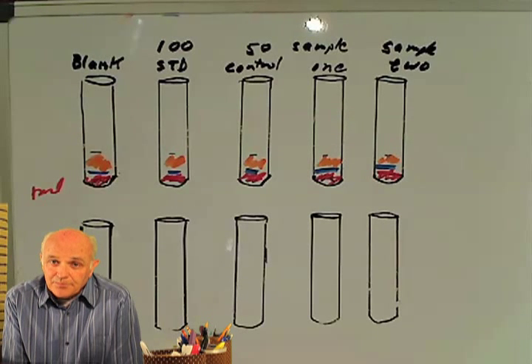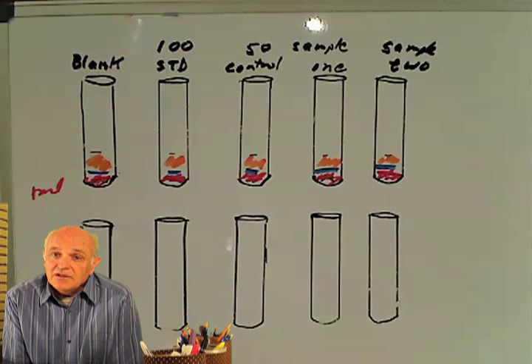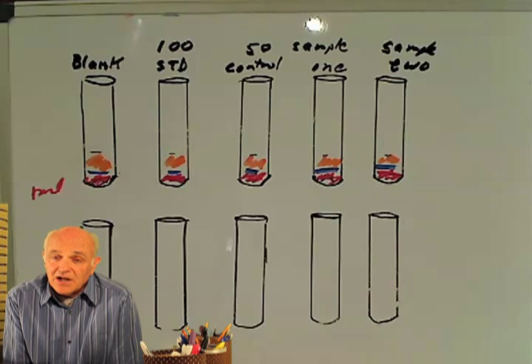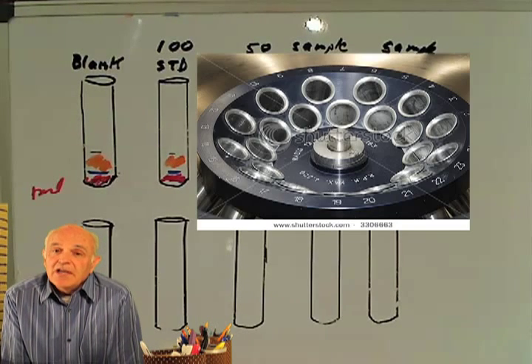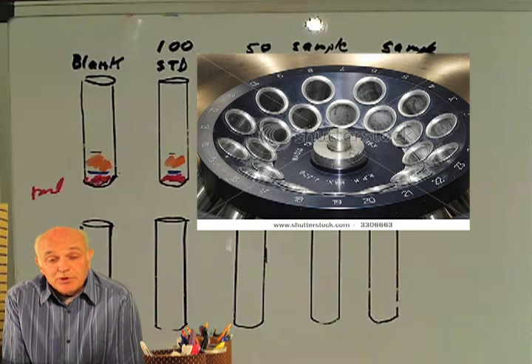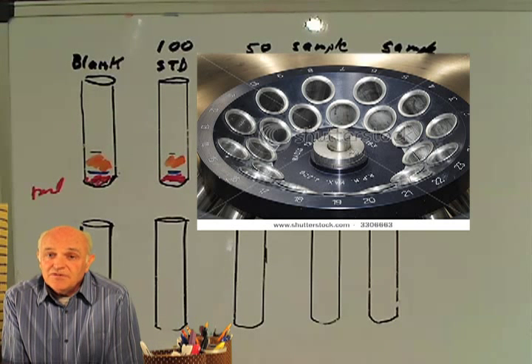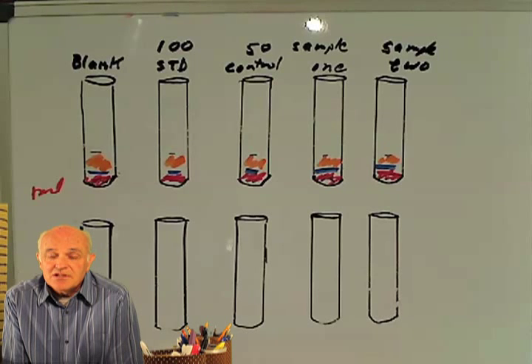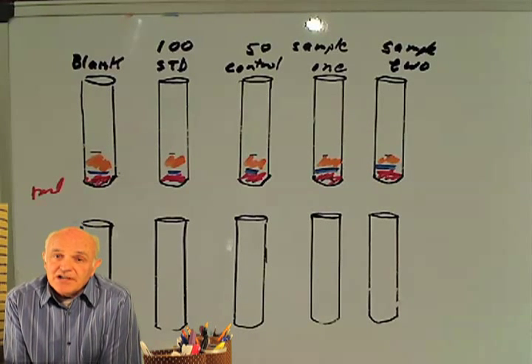The hydrophilic layer on the bottom. Remember, an ordinary solvent if it's not chlorinated will go to the top, so the ether will be on top. A common procedure at this point is to put the tubes in a centrifuge and centrifuge them to help this separation process. It'll just take a few minutes. Put them back on the rack. Now the ether is nicely separated on top, the hydrophilic layer which is now junk is on the bottom.